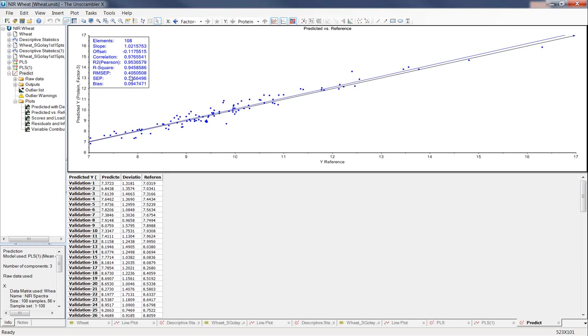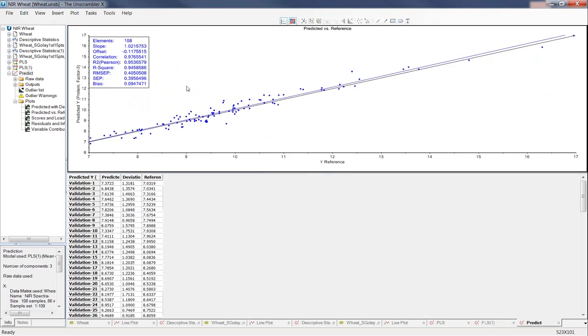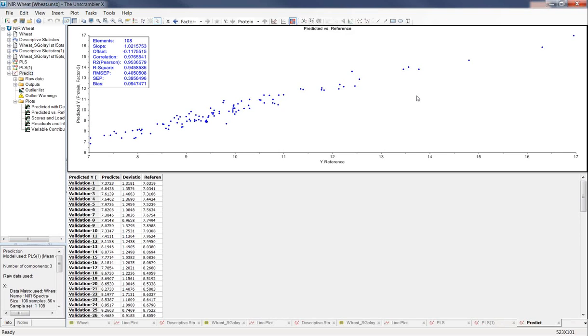As you see, our error is 0.4, which if we go back, we can see is a little bit lower than our error in our calibration data set. That's unusual, but it's not necessarily a cause to worry, just so you know. But typically you'll have a higher value there. But the closer that RMSE EP is to your RMSE CV, the more accurate your model is.